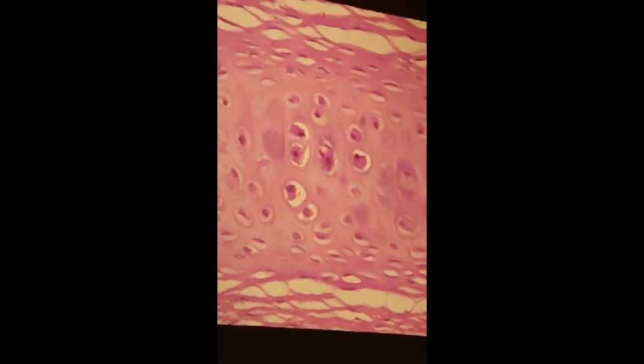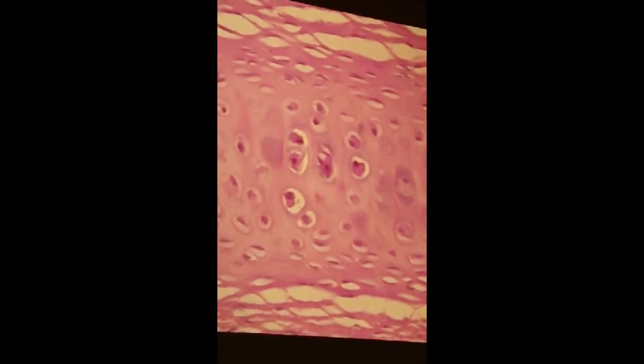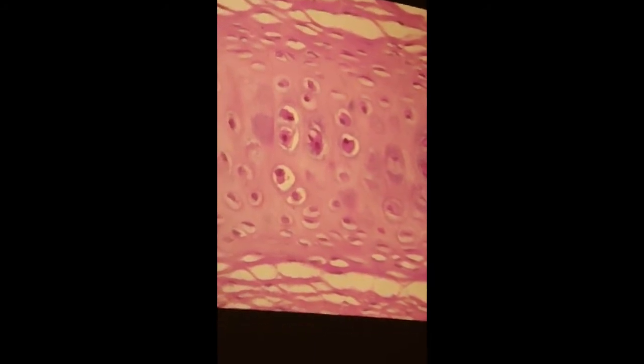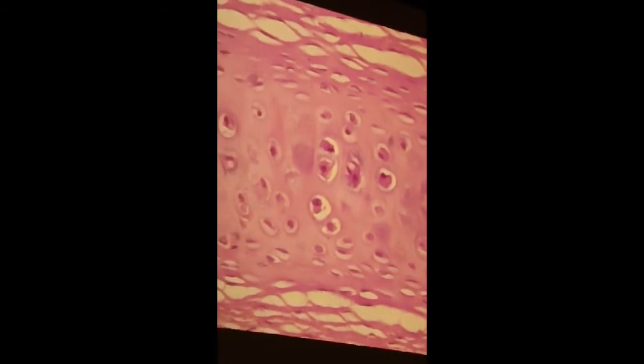This is the region that has chondroblasts that ultimately will pump themselves up, like these chondrocytes in their lacunae, and surround themselves with matrix. All right? That kind of growth or addition to the surface is called appositional growth, in contrast to interstitial growth, where you have the division of a chondrocyte. And here you can see these guys right here is an isogenous group. You can see the 2 nuclei just beginning to form that little bridge of matrix between the lacuna that they shared at one point immediately after dividing.